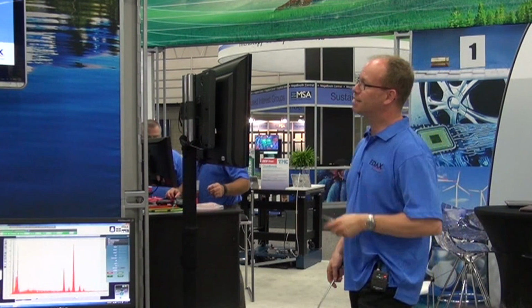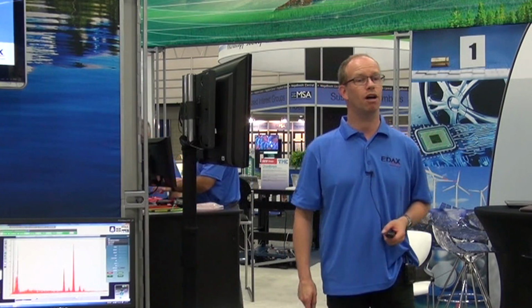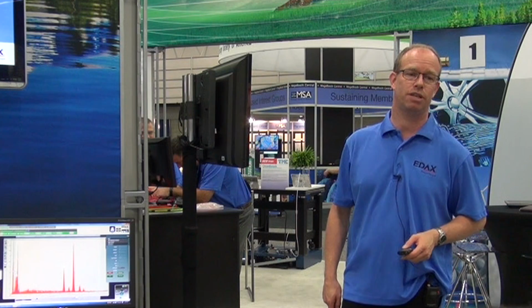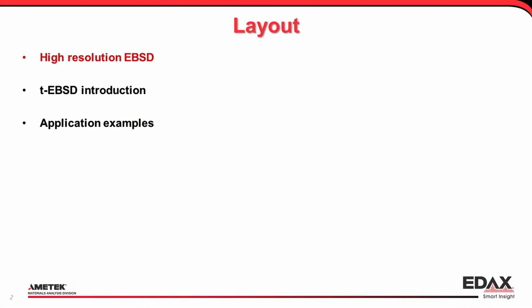Okay, because that's what I'm going to talk about in the first half of the presentation. So that's what I mean here by the orientation measurements in TEM foils. Now, first a little bit of background why we want to do it.